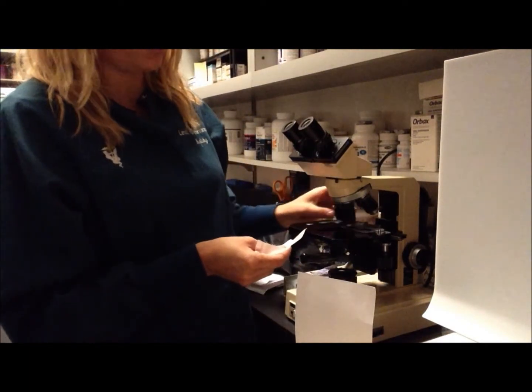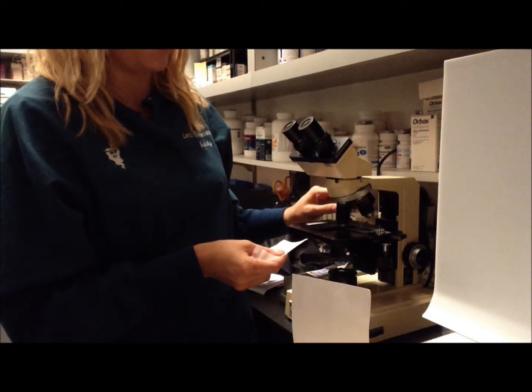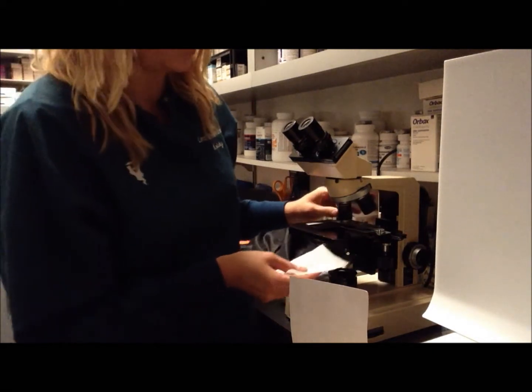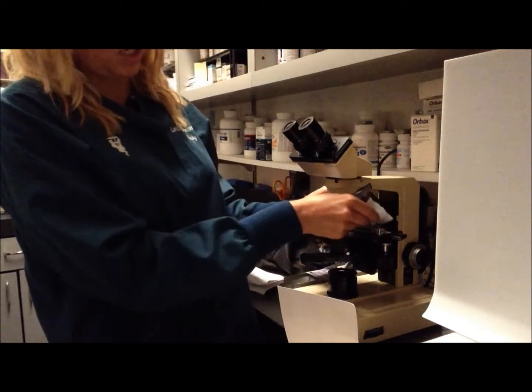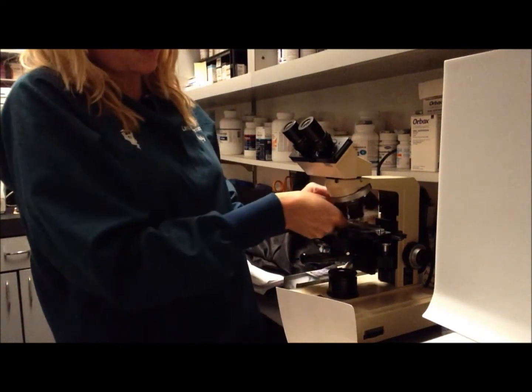So with the oil immersion ones, you know, you can definitely find that there's a large amount of oil on it afterwards. So after every usage, you should clean each lens piece. You lightly wipe the area.